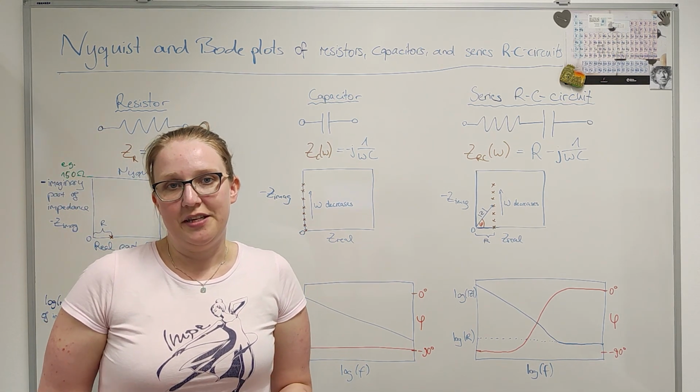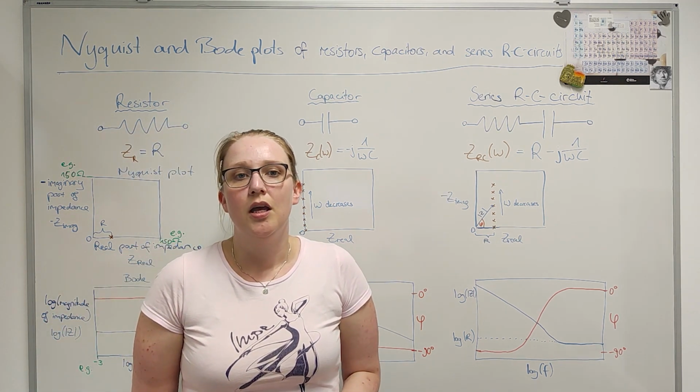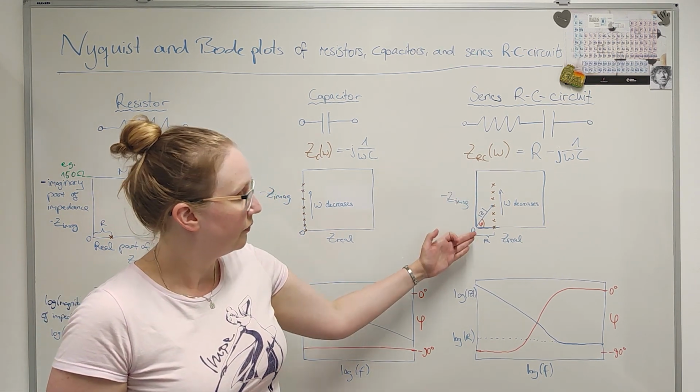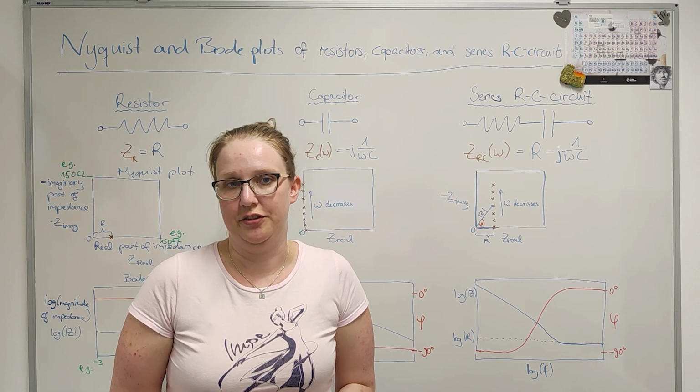If resistor and capacitor are connected in series, their impedances add. In the Nyquist plot, the impedance spectrum is a straight line parallel to the imaginary axis. The current always has to flow through the resistor when charging the capacitor.